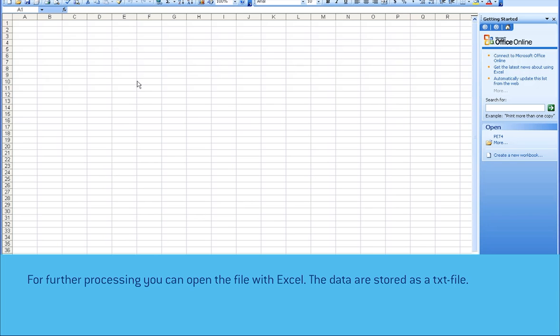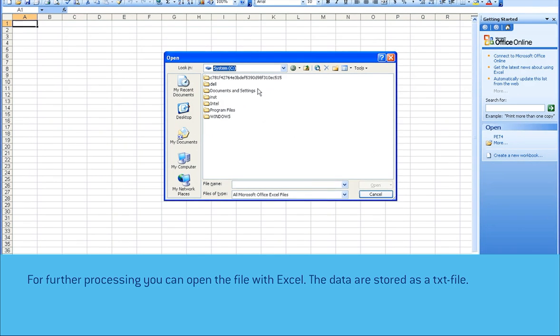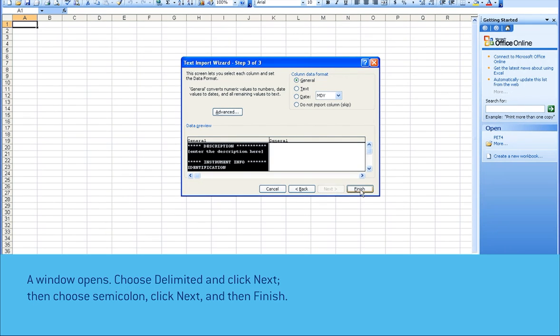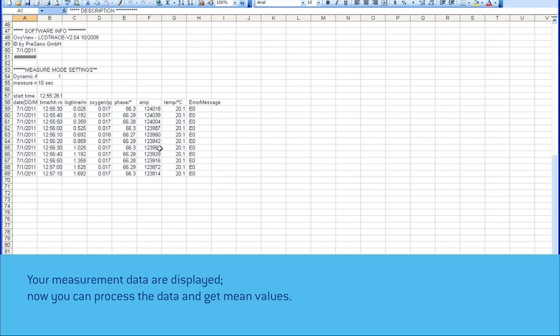For further processing you can open the file with Excel. The data are stored as a text file. A window opens — choose Delimited and click Next, then choose Semicolon, click Next, and then Finish. Your measurement data are displayed and now you can process the data and get mean values.